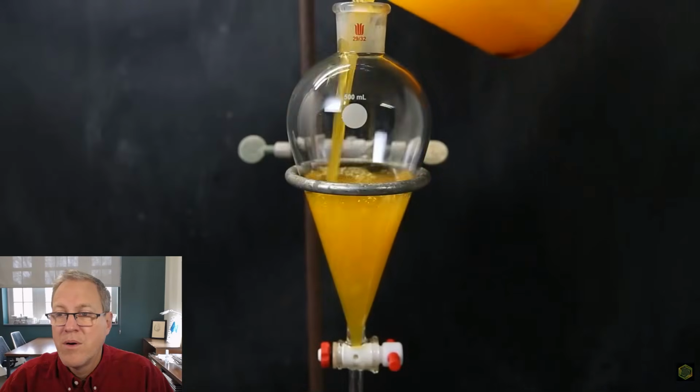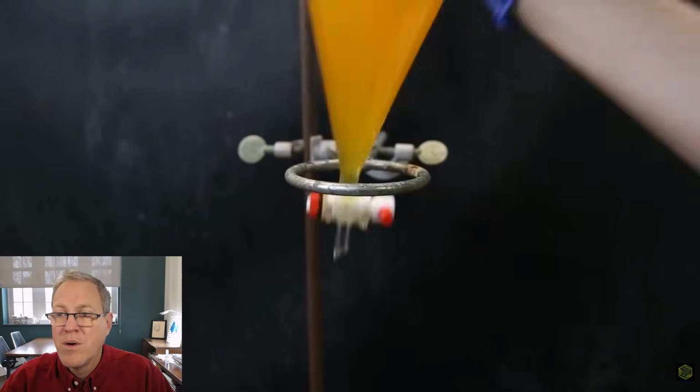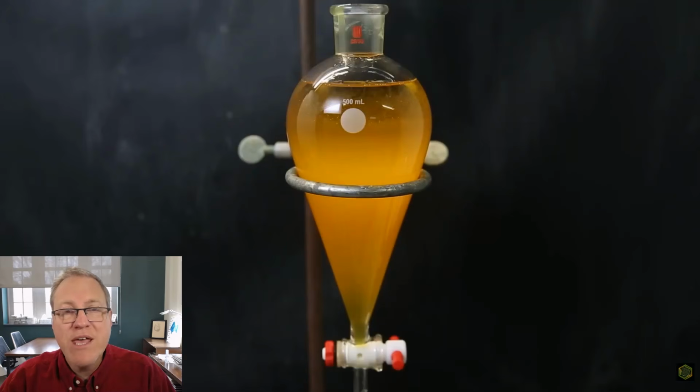I then move it all to a separatory funnel and wash out the beaker with more ether. I then bring the layers into contact and... Okay, so he has shaken up this mixture. It's got ether in it. It has a little bit of base in there, excess base, water, salts from that neutralization, and his product.